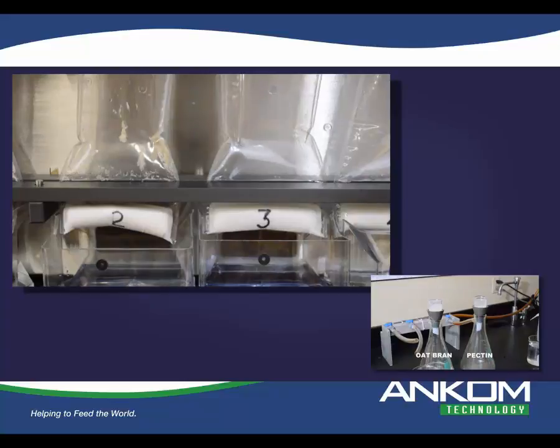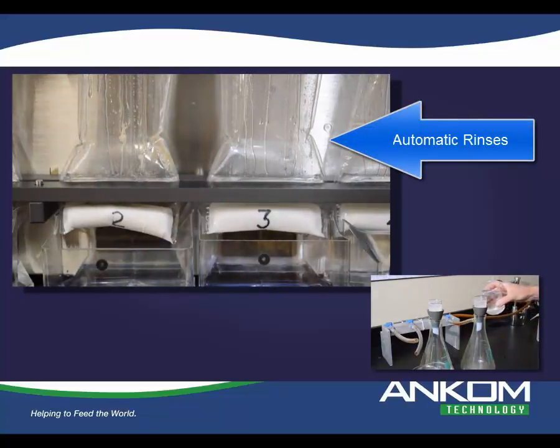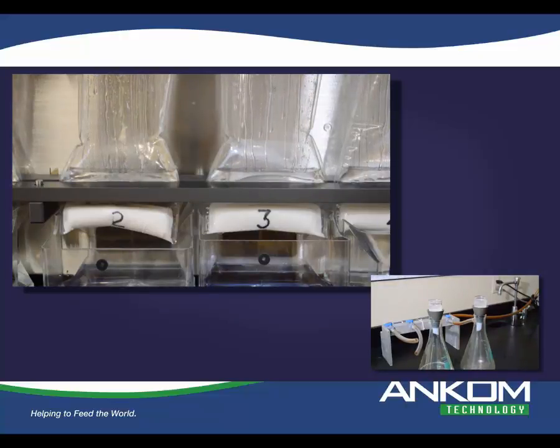Likewise, with the conventional method, using the fritted glass crucible with a diatomaceous earth base, it's not uncommon for the filter to clog. A gel forms in most of the samples that have been digested, and certainly after precipitation. And that gel needs to be broken, for lack of a better way of saying it. In 991.43, it basically talks about how you break the gel surface.